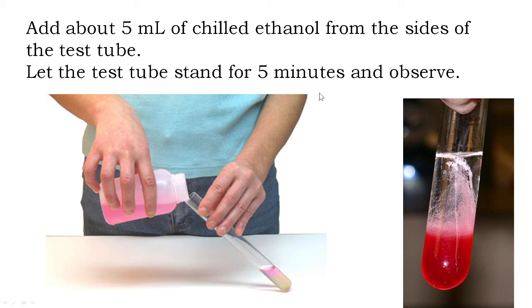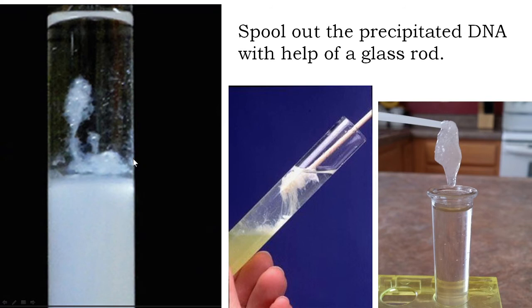What you will observe is that after adding chilled ethanol, as time goes by, something starts to precipitate out of the mixture. These mucus-like, thread-like things are nothing but the DNA. So DNA starts precipitating after addition of chilled ethanol. You then take a glass rod and take out the DNA — this is called spooling, as you have studied in your theory class. When you pick out the DNA from the mixture with a glass rod, it is called spooling.